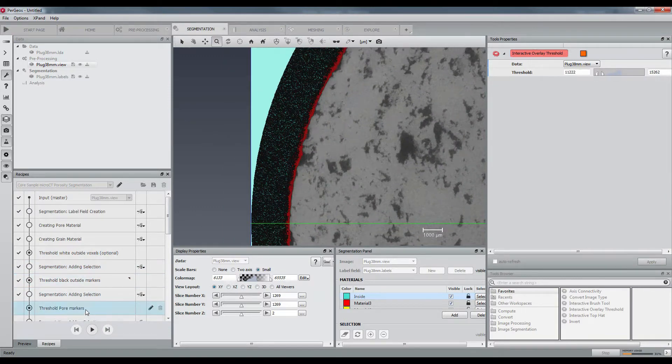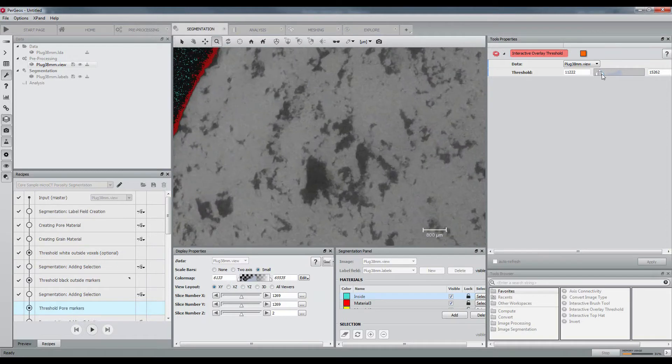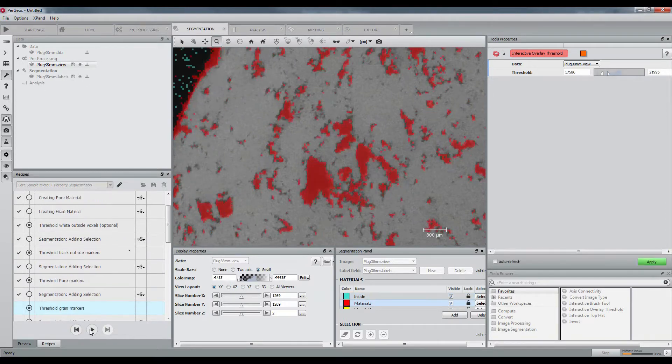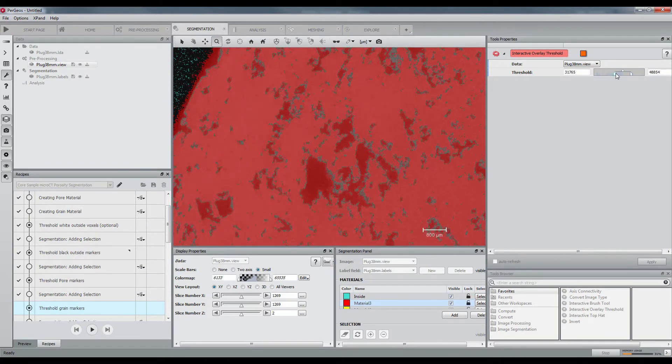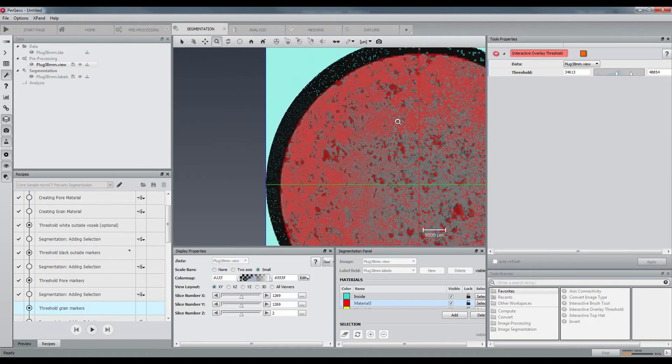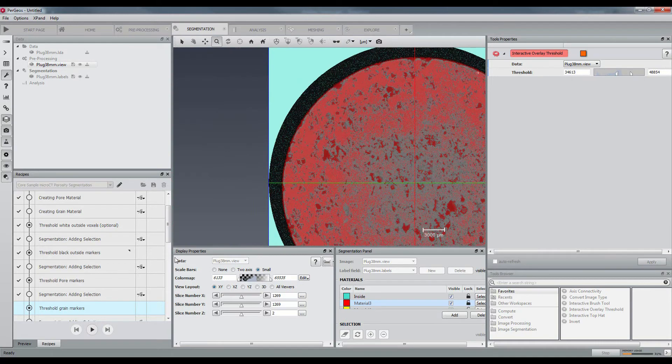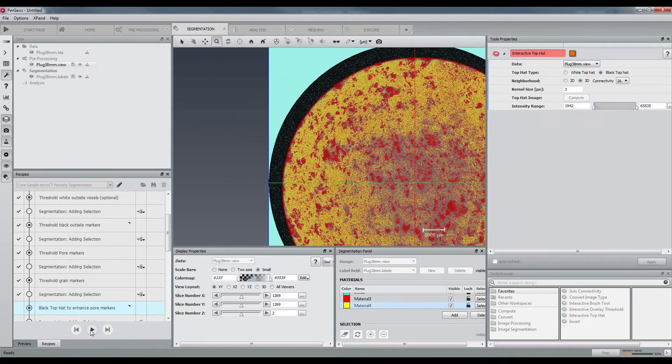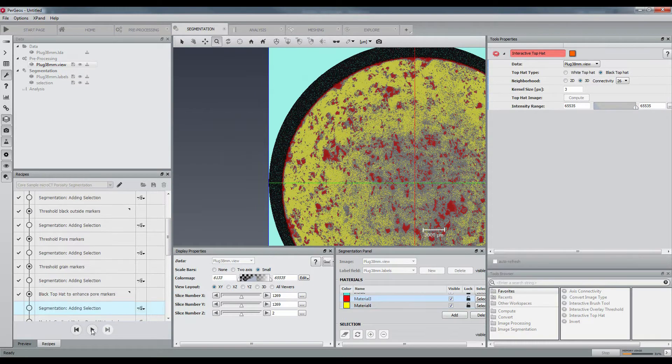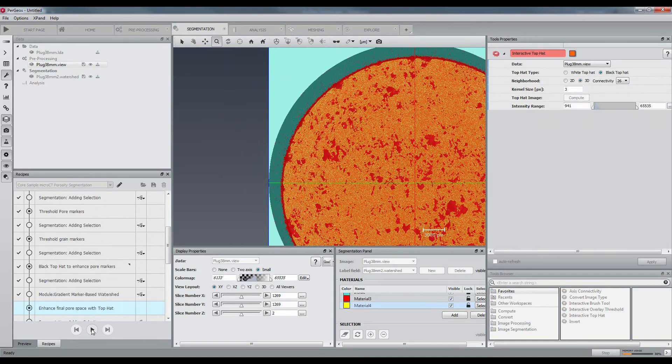The pores will be marked with thresholding as for the grain. The watershed is computed and now I can enhance the pore space with a black top hat.